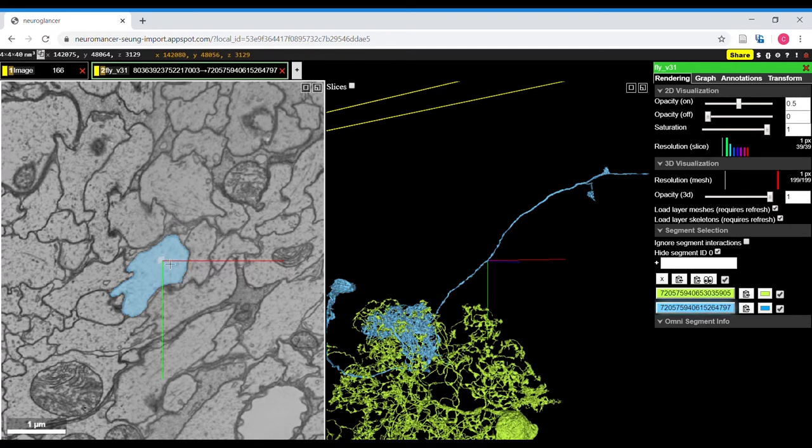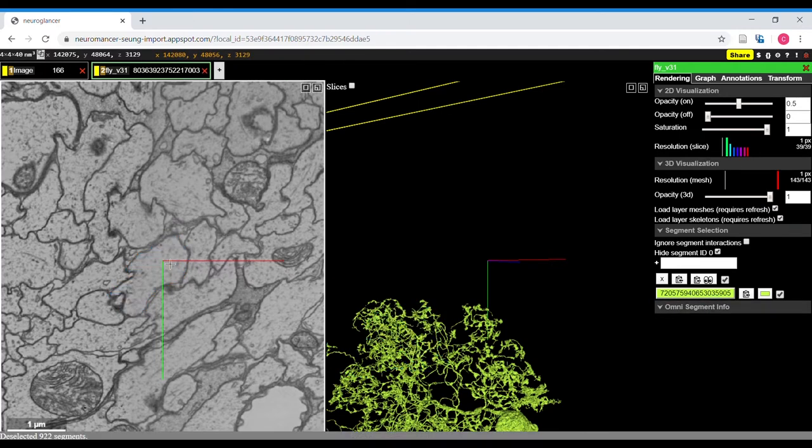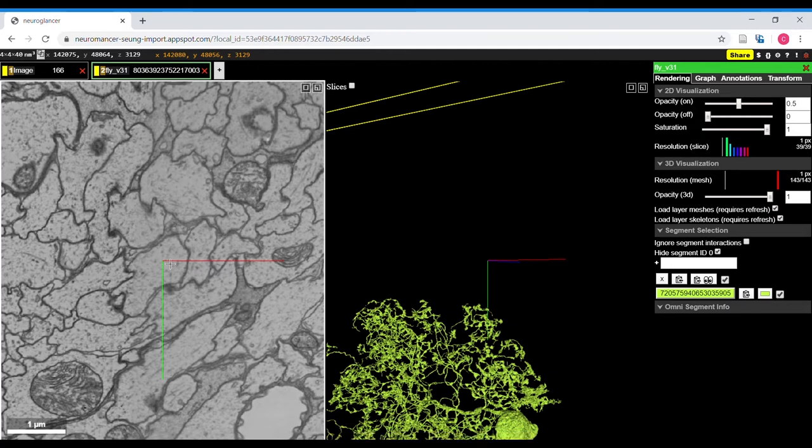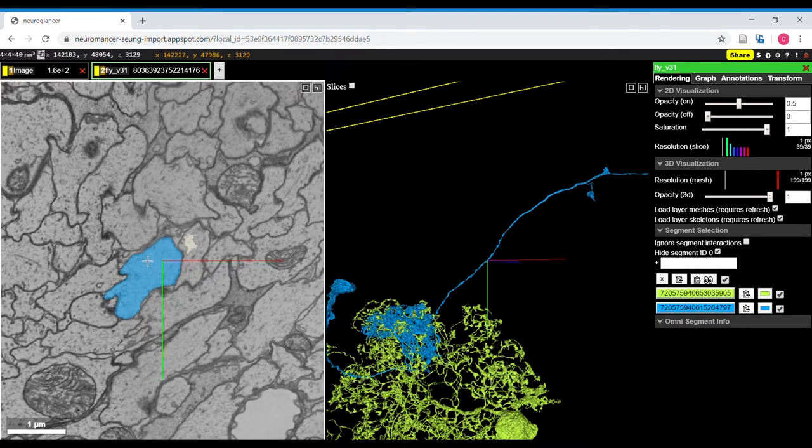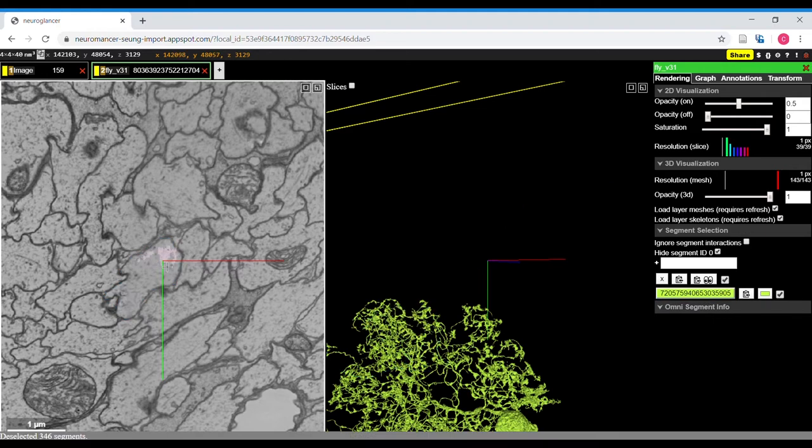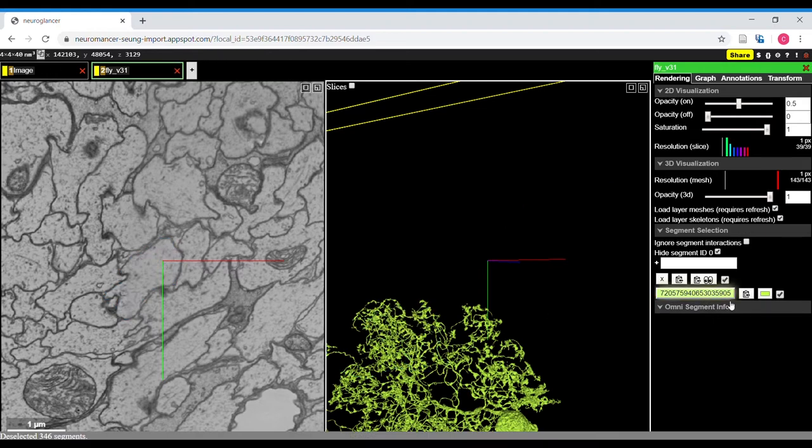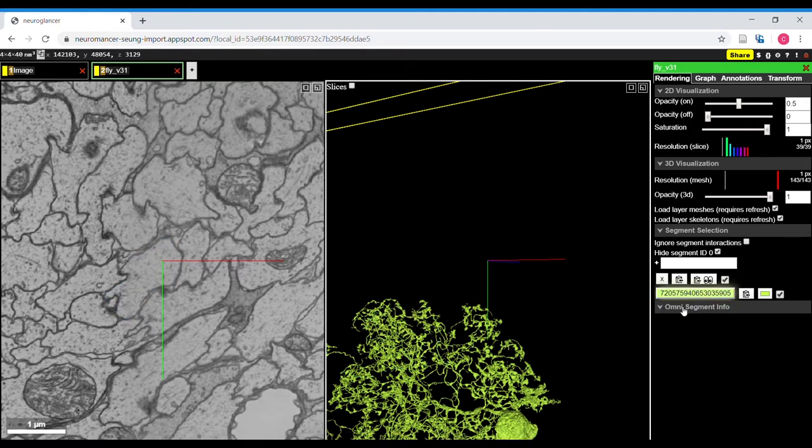If I double click on it, it deselects that segment and double clicking it brings it back up. And the one that it brings up is the most current version. Note that double clicking on a neuron actually deletes it from the list. You can see that the blue segment is gone here.